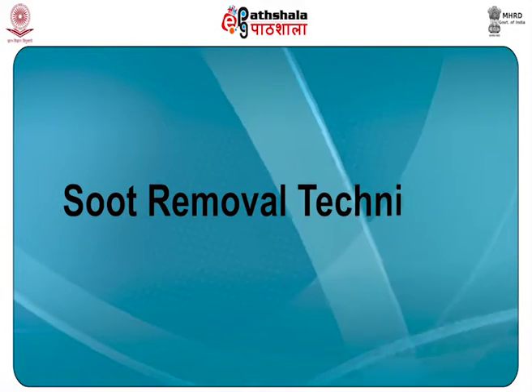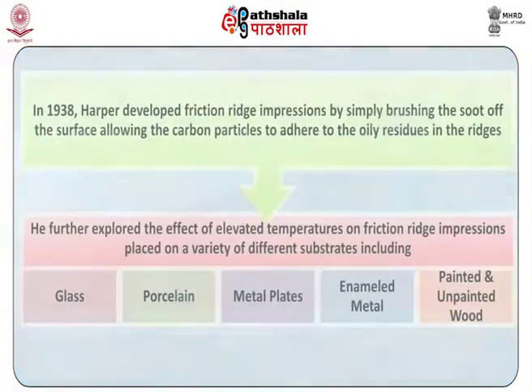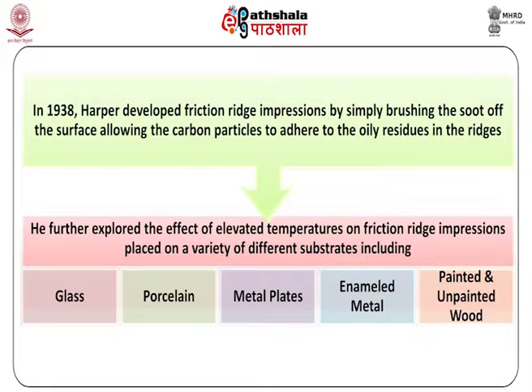Next, we will study the soot removal techniques. Often the first step in examining the arson exhibit for friction ridge impressions involves the removal of soot. In 1938, Harper developed the friction ridge impression by simply brushing the soot off the surface, thereby allowing the carbon particles to adhere to the oily residues in the ridges.